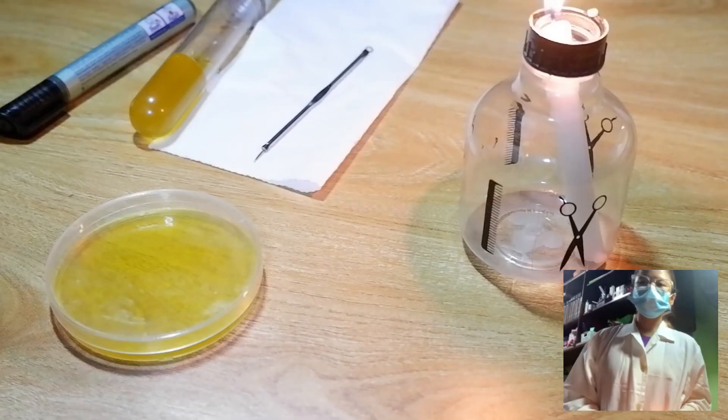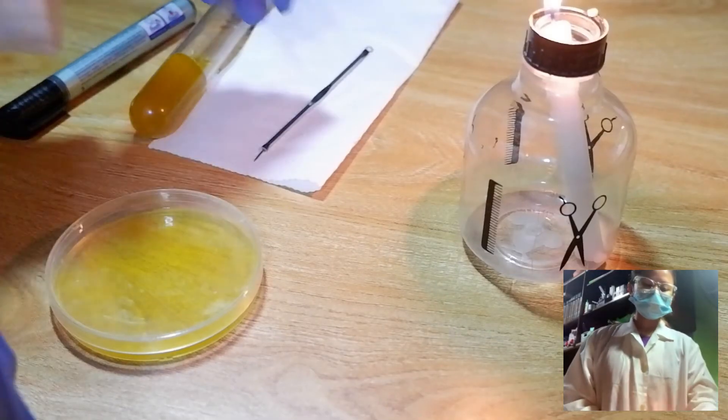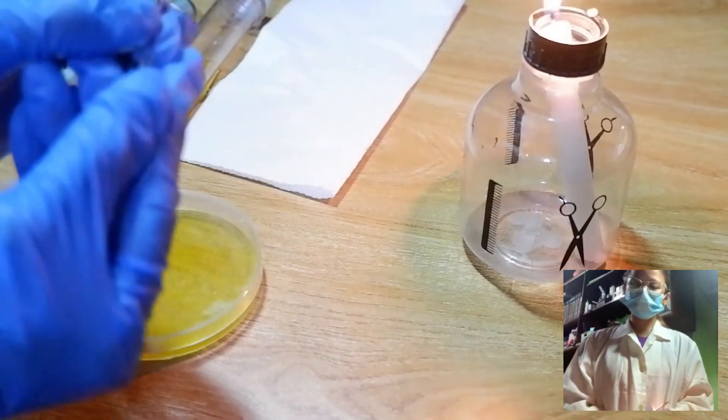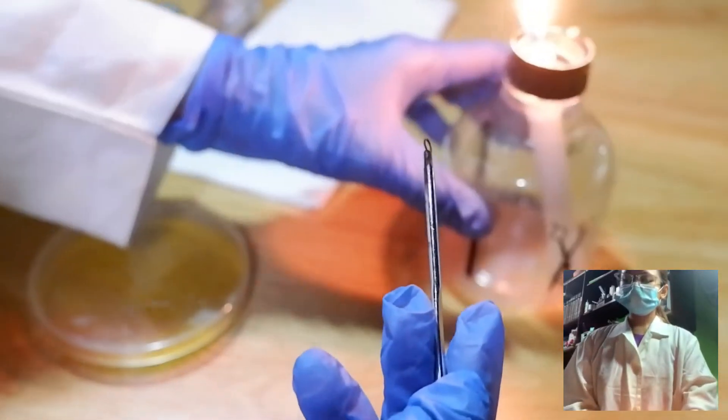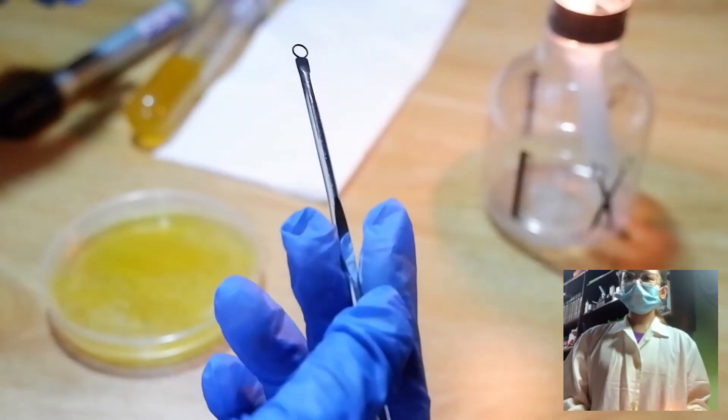Now, we will do the quadrant streak method. First, get the inoculating loop, flame it to sterilize, and allow it to cool down for 5 to 10 seconds.